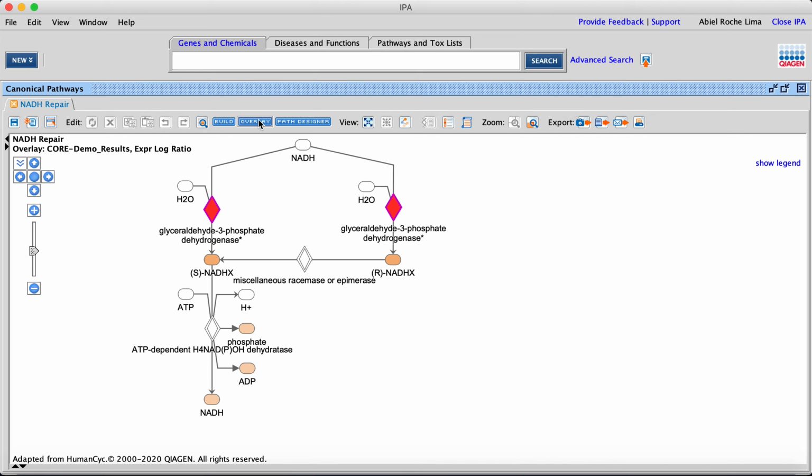So if in the literature the citations declare that protein A, in this example, not the example that I am giving in particular, just this verbal example, if protein A is upregulated in the literature, and in our information we have it as upregulated, and the literature is saying that when the protein is differentially more abundant, or if it's a gene upregulated, and in our data it is upregulated or differentially more abundant, then it leads to activation. That's good up to that point.